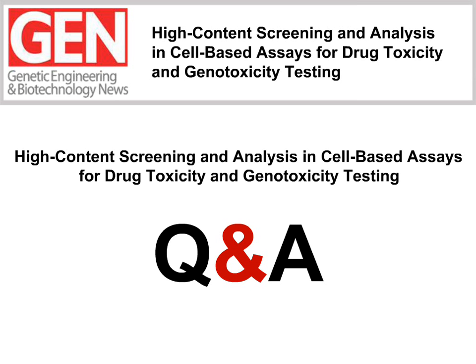Yes, sure. We tried to induce it in parallel with hamster cells. We tried to induce micronucleation both on MSC cells and on fibroblasts. And it was very interesting because when we added the mitomycin, even at very high concentration, those cells were not able to show any formation of micronuclei.